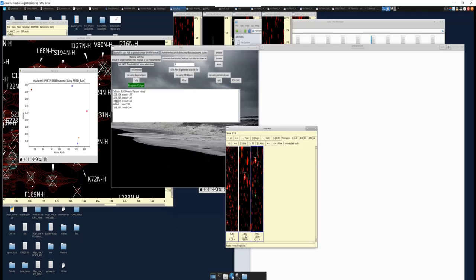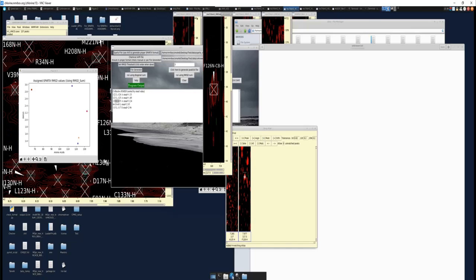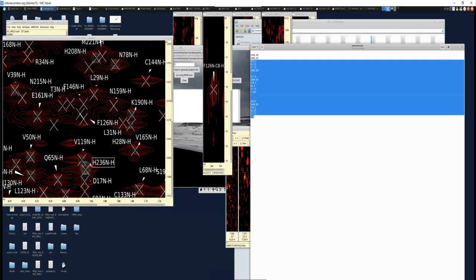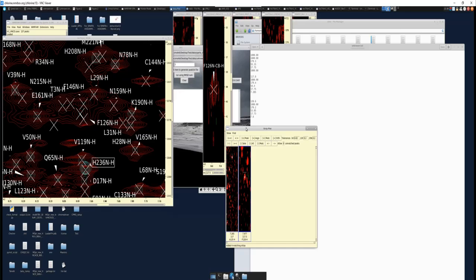So this third match as well can be eliminated since it does not match with the Sparta Plus of what it should be. So all that leaves is this singular match here, right? This phenylalanine, which if you put in gives a good RMSD and matches with your previous one, right? So in this way, we not only used Sparta Plus to assign this string of 3 amino acids, right?